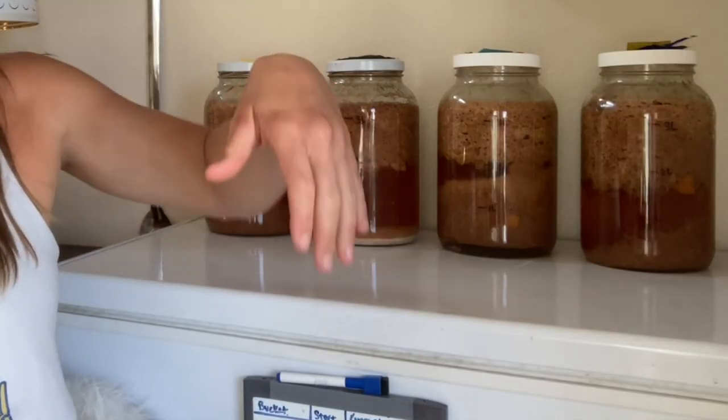Now, the difference in cell count here could be due to the stages that the fermentation is going through. I also sampled from just under this peach layer in all four of them. So yeah, I'm sure that where I sampled is also going to make a difference in the cell count that I see. But the lower cell count that I observed in the Red Star Distillers yeast could be because it is still ramping up and reproducing, whereas the lower cell count that I saw in the K1V-1116 could be because fermentation is ramping down. You can see that there's a lot of lees settling out right here, so that might be a lot of yeast cells that are starting to settle out of solution. Now, it's possible that the D47 and the Premier Cuvée have reached that point where they've hit maximum reproduction and now they're just fermenting out until there's no more sugar left.